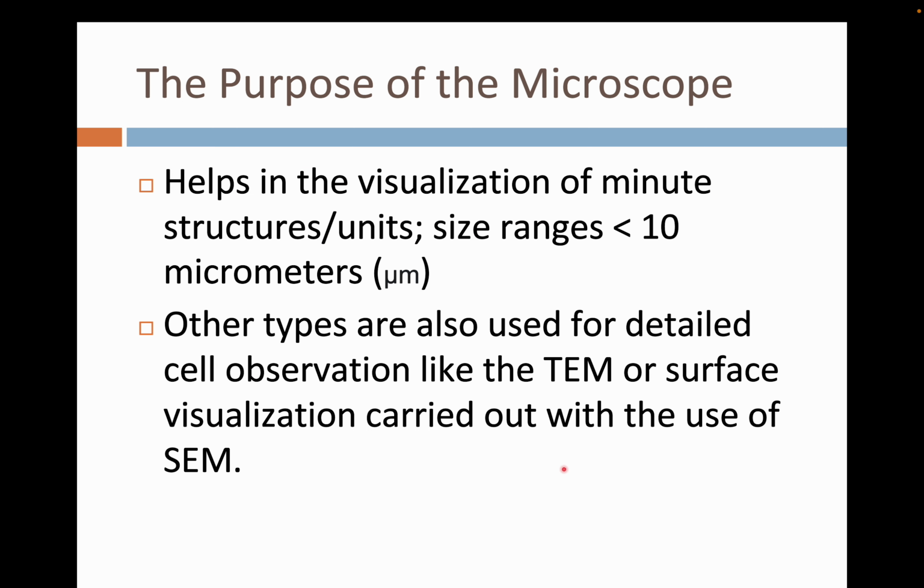Okay. Now, in terms of function, you can simply describe microscopes as tools to help you visualize minute structures, units that are very small. The size ranges between less than 10 microns, or 10 microns and below. So usually really, really small specimens, like essentially cells.